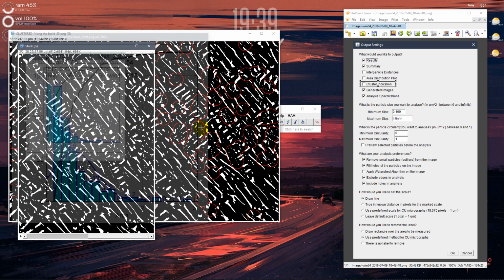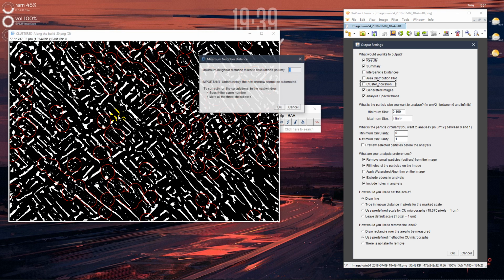And you don't have to worry about these windows. They will open and close by itself. Just wait for another window which will ask you for specifying another settings. So the area distribution plot was just calculated before that. As you've seen, there were some of the plots which were saved. You don't have to worry about them. You will have a view on them.